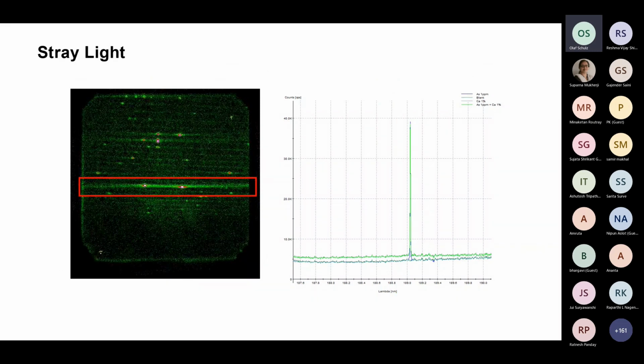Now, one characteristic of all optical surfaces is their ability to scatter light. And this is undesirable light and is commonly referred to as stray light. Now, when stray light reaches the detector, it contributes to the signal noise and thus affects sensitivity. Stray light can be defined as light leaving the surface of the diffraction grating in other directions than those defined by the grating equation.